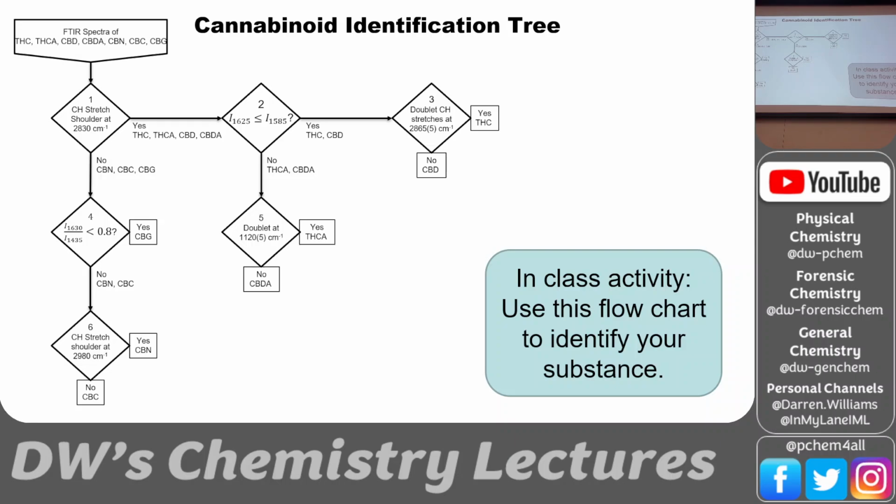You got that? The CBDA molecule. Yes, it's definitely right here. These are very similar. Well, these are the same.